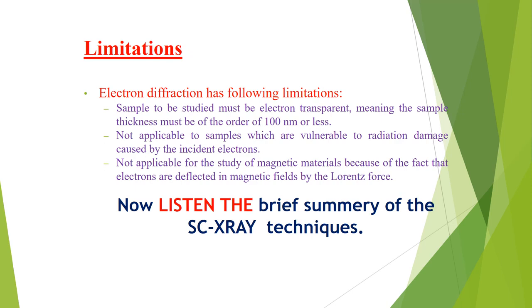So dear students, in this single crystal X-ray diffraction technique, we can use different kinds of sources to analyze the single crystal, or the crystal in bulk form or in powder state.